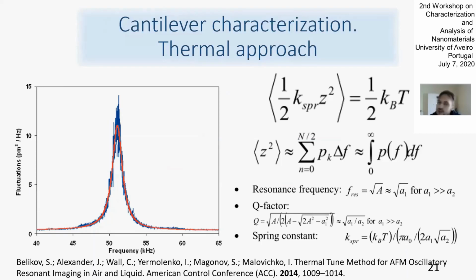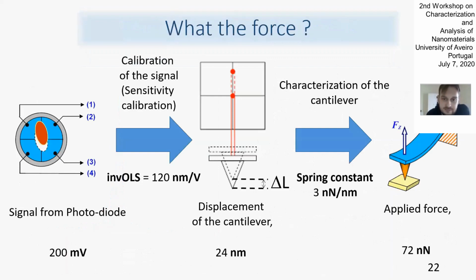our cantilever is. This is important because not in all cases is what you read on the box of the cantilever, where usually the manufacturer gives some values of the stiffness, the real stiffness, because in the production process you have a deviation from this stiffness, because the production process has some differences in any case.